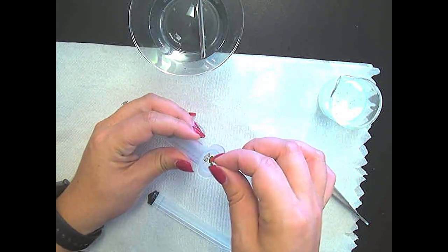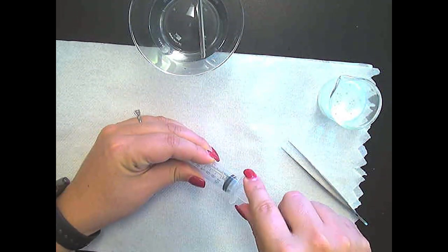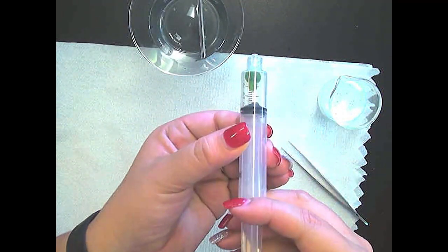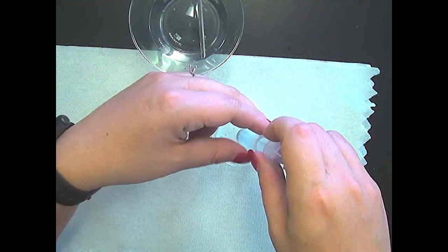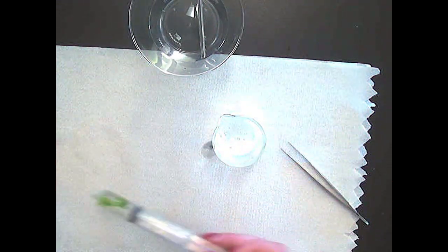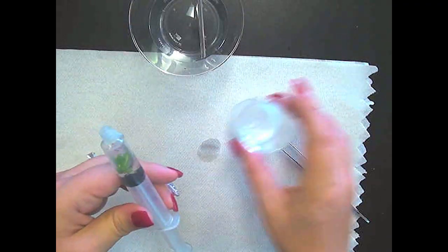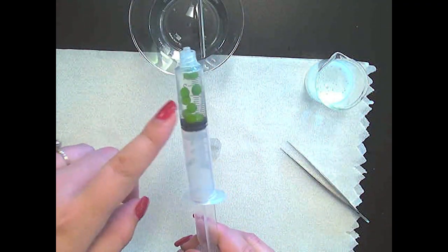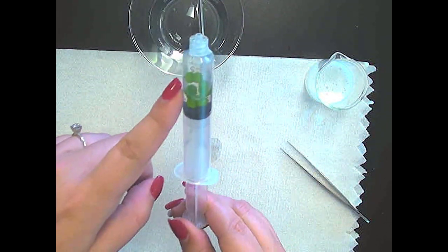We're going to be using 10 chads, and when we add the plunger on top, we want to be careful not to smash any of the chads. We're not going to go all the way to the top, just enough to get us started. And we're going to use this special solution to suspend the chads and remove the air from the syringe itself. You'll notice that when you put your chads into the syringe, they do float. It's a little hard to see here because of the angle, but they do float.